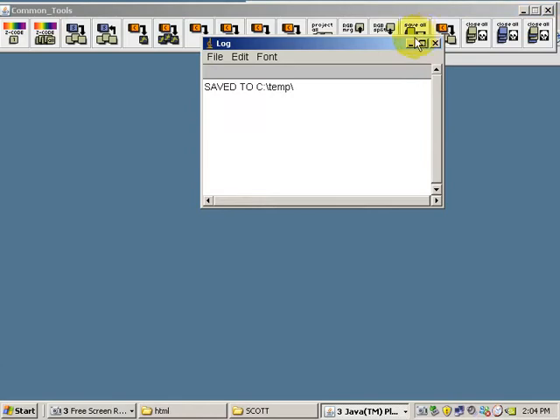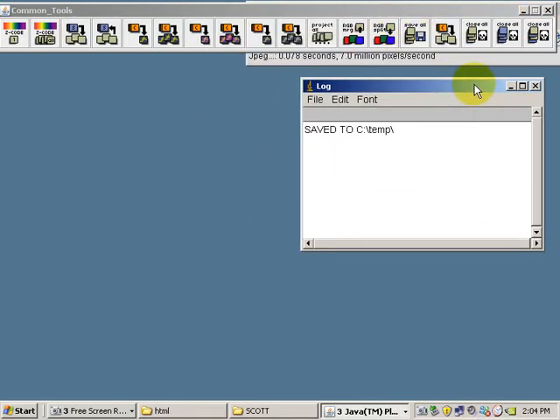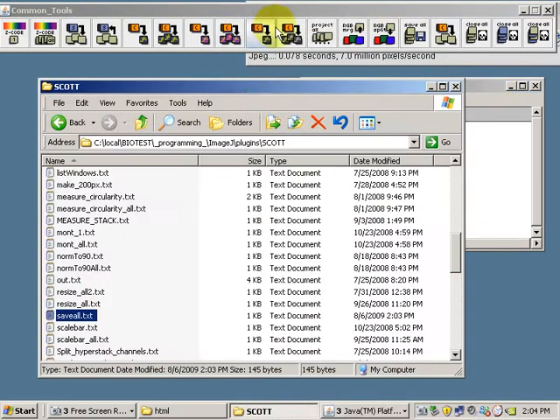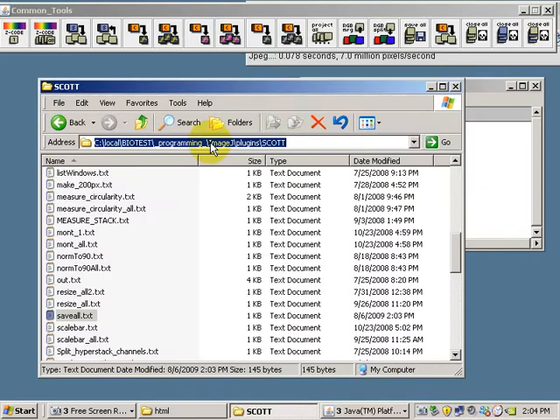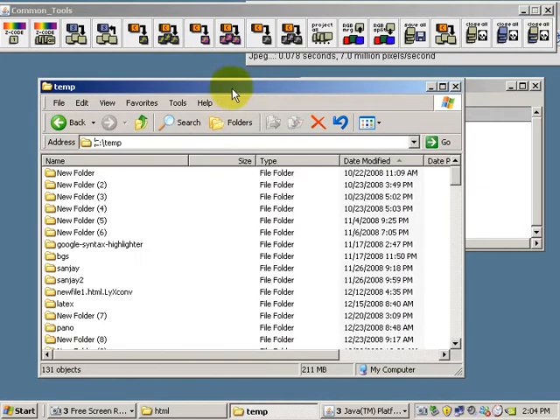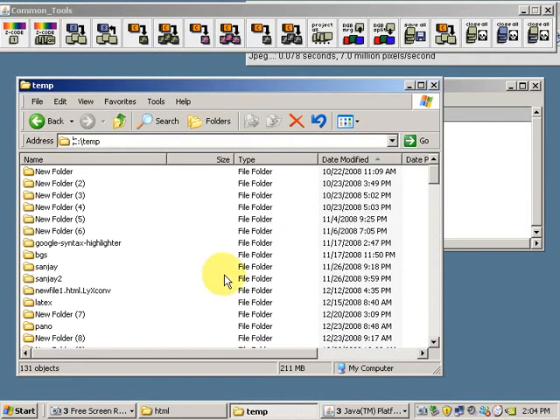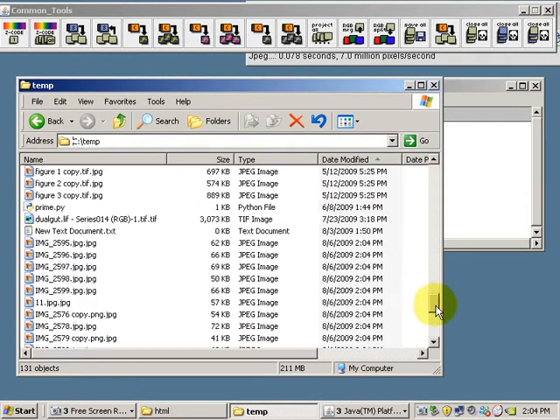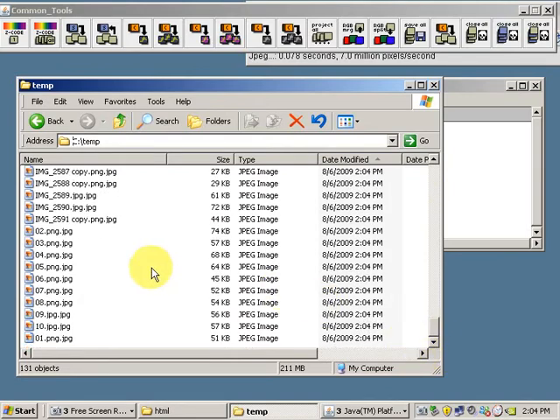So it said it saves it to C Temp. They're the most recent files. So here they are. These are the collection of JPEGs.